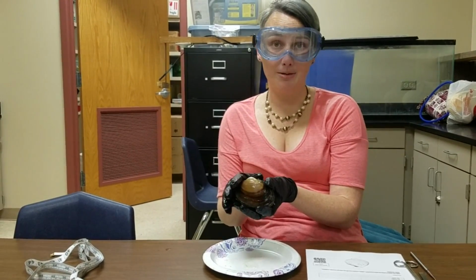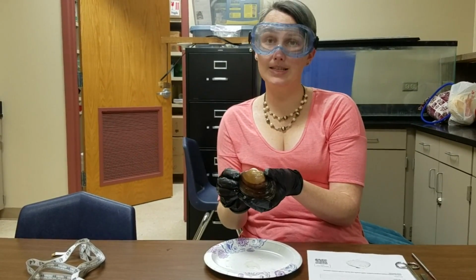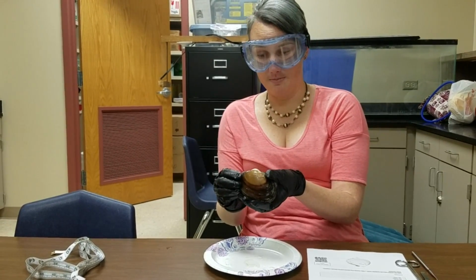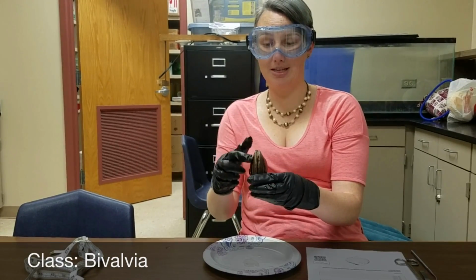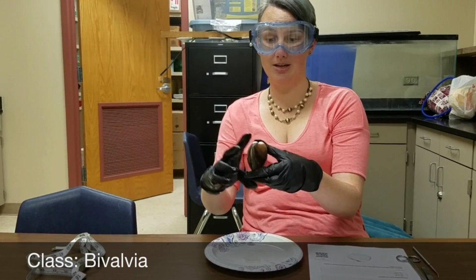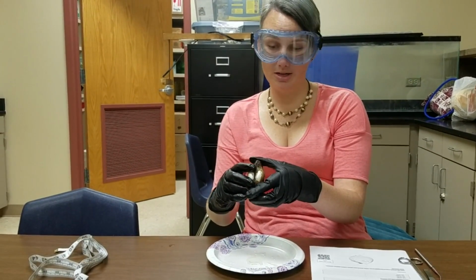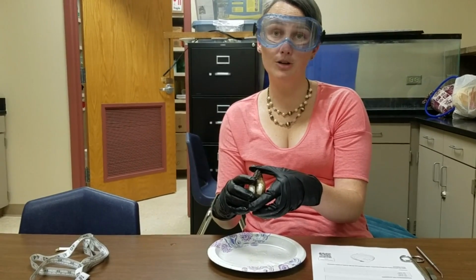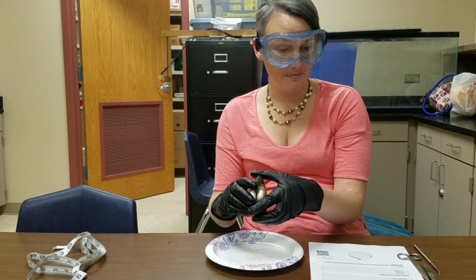So these are clams, also known as mussels. They are in kingdom Animalia, meaning that they are animals. They are in phylum Mollusca, okay, mollusks, so soft bodies, have shells. And they are in class Bivalvia. Bivalvia means they have two shells, just like you can see here. They've got a shell on this side and a shell on this side. You're going to want to define all of those words that are on your lab sheet. So use your notes, use your mollusk notes, and you can fill those in.